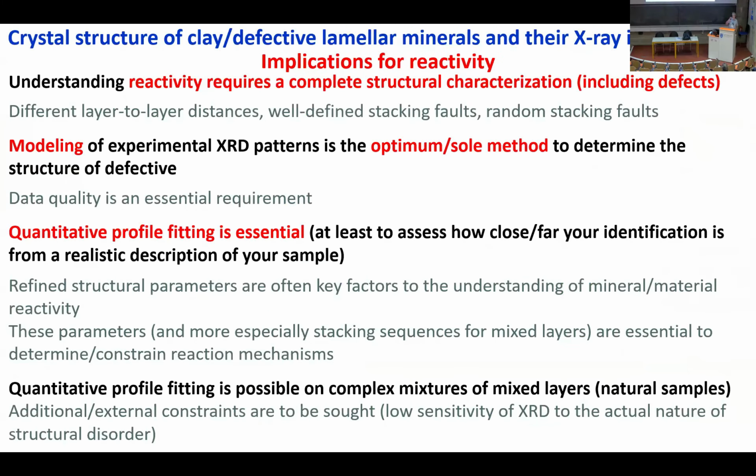And what I would like you to get from that talk is that position may not be sufficient. We've seen that. You need to include not only the position of the diffraction peak, but also their profile. There is a lot of information in that profile and intensity distribution about Bragg peaks. And it is possible to get that information for a precise identification of your mineral.